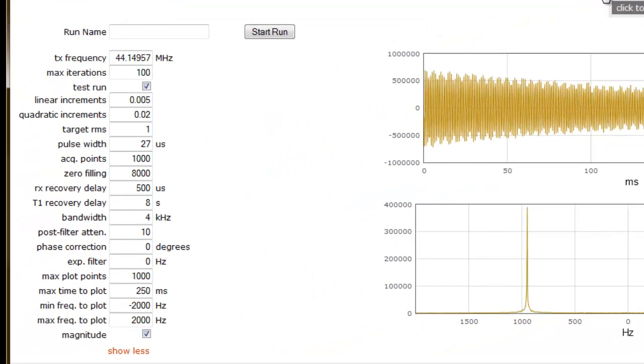So let's refresh our memory on some of the parameters we'll need to adjust. The AutoShim script executes a simplex optimization algorithm. This algorithm systematically adjusts the shim coil currents one at a time, and monitors the effect these changes have on the intensity of the spectrum signal after each adjustment.